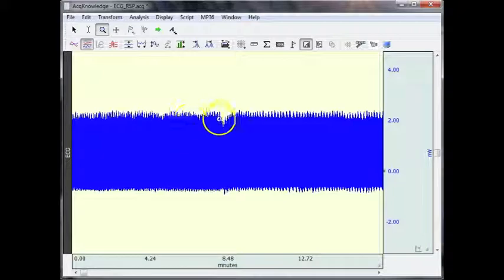So at some point, I'm guessing they were probably lying down, sitting up. But hopefully if we average the waveforms during the two periods, we should be able to highlight a change in the overall averages for sitting and standing, or laying and sitting, depends on what the subject was doing.